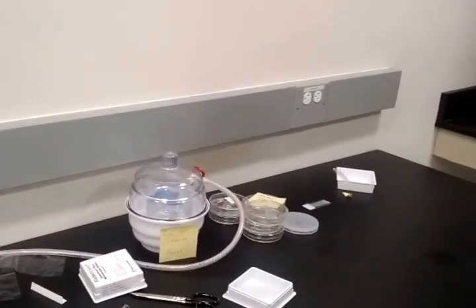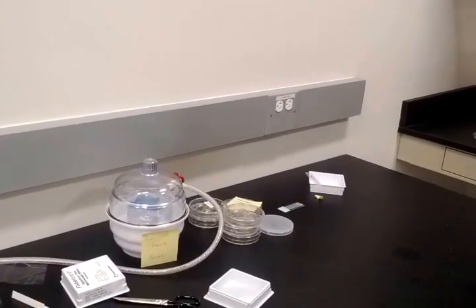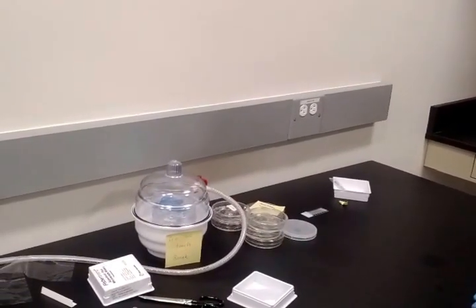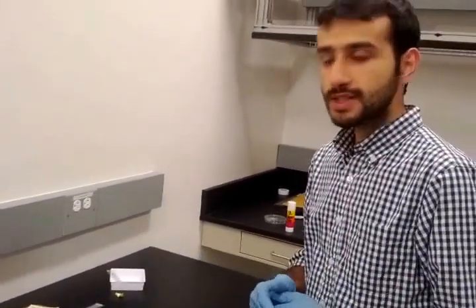Okay, well, hello everybody, this is Burak and Ijun. I'm going to show him the way I exfoliate molybdenum ditelluride onto PDMS substrates. And we want to take a video record of it so other people can benefit from that as well.